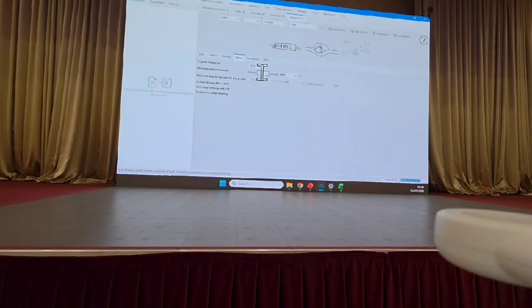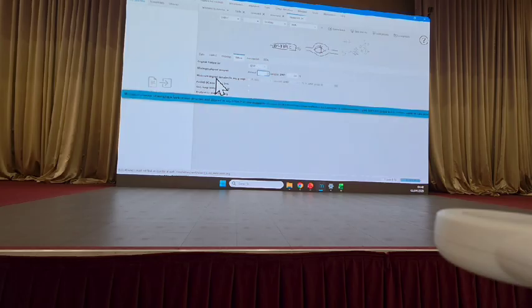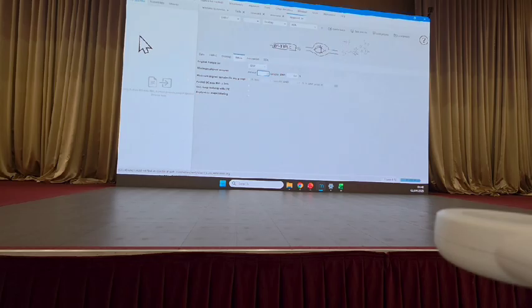So let's say for some reason you have in one of your 3 leaf replicates, you see a peak, but then it's not found in the other 2, it will get removed. Because again, we're using triplicates, we can put that we want to see it 3 times. And again, maybe you're only using 1 replicate, which is fine. Maybe you're doing a large screening of thousands of samples. You can keep it at 1, but today we'll use 3.